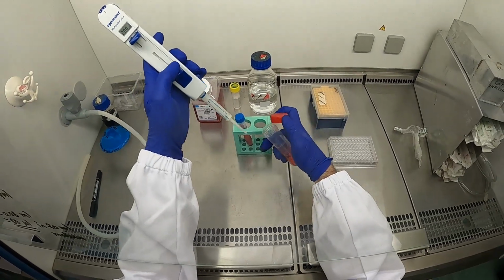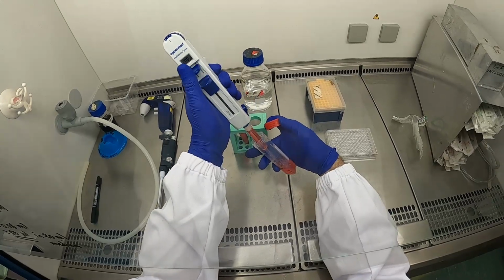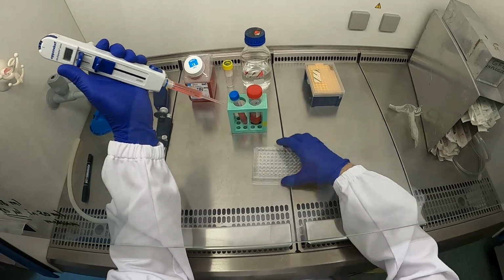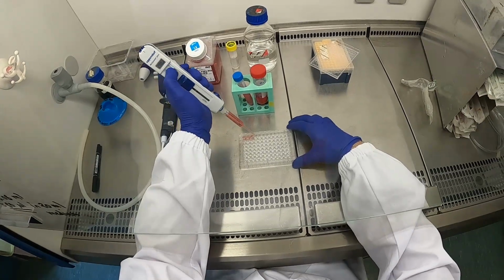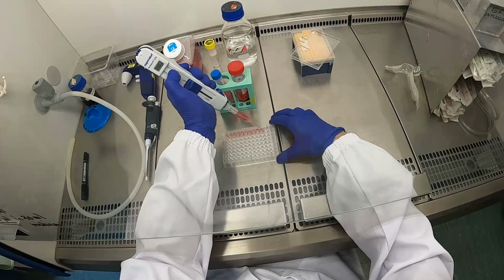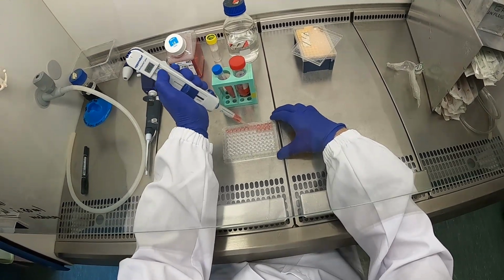Mix your cells, and then pull up the plunger like that to fill it, and then press the dispensing lever once to reset it. Then you're ready to dispense 200 microliters with each press of the lever, like that. Okay, and you should be able to do 2 rows with this.